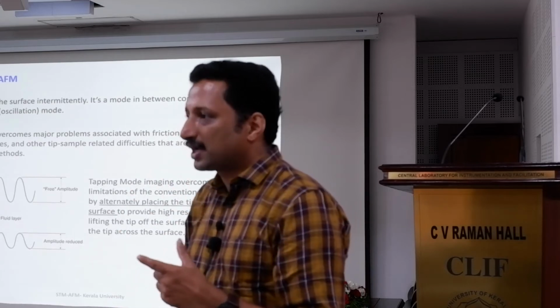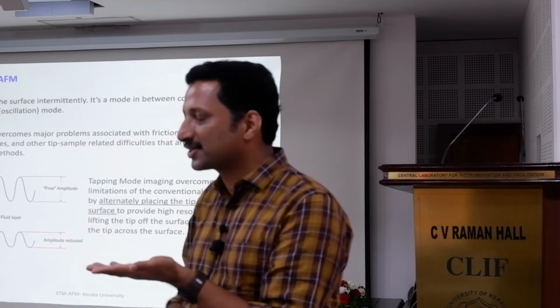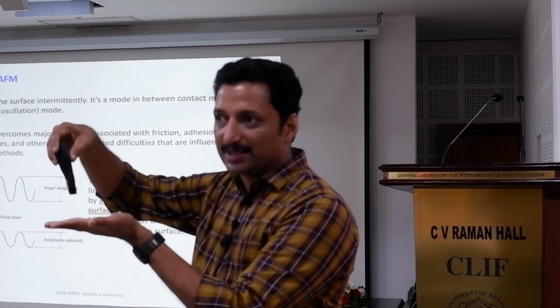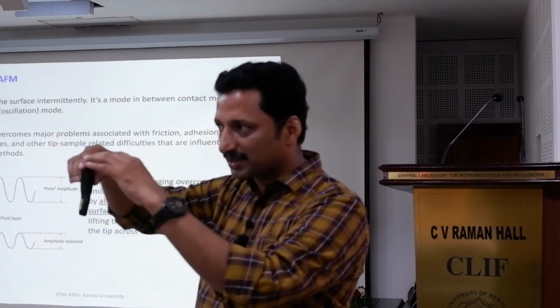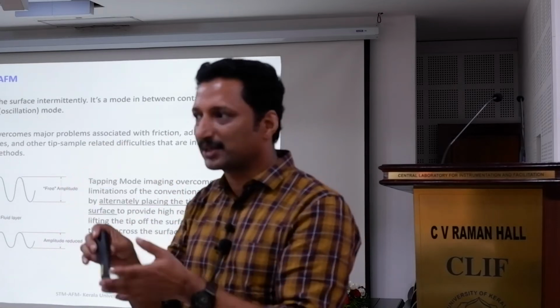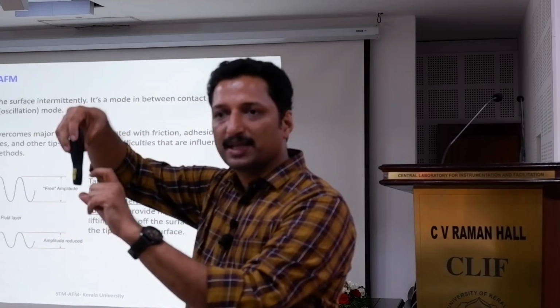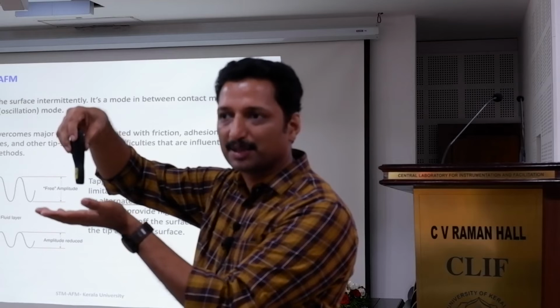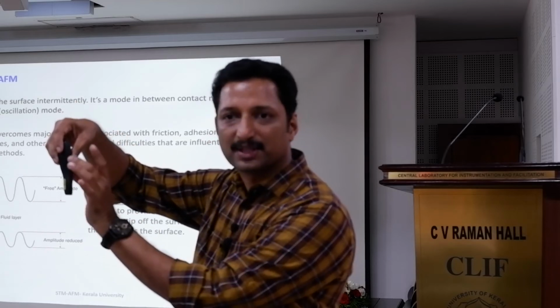Phase shift actually depends upon how hard the material is. That's another interesting thing. If it's a soft material, that's what I was saying. Compared to STM, the difference in AFM is that it can actually measure something a little bit inside the material also. So the tip comes here. It is not only interacting with the last or surface atoms. If it is a fluffy sample, the entire elastic properties can be measured here.